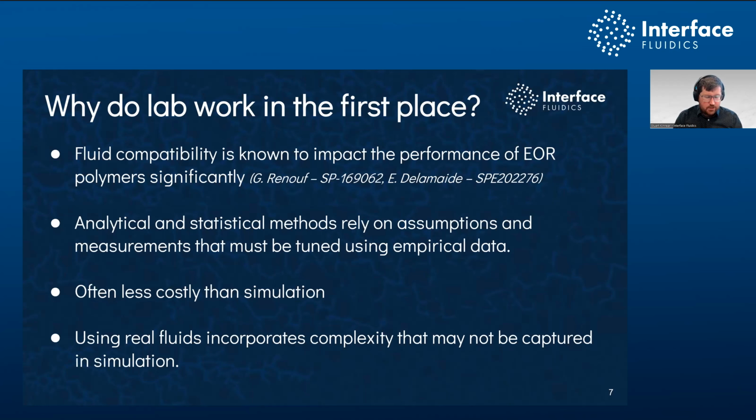And finally, using real fluids incorporates the complexity that is very challenging to actually capture in a simulation program. The nuanced changes in oil composition or water composition over time is really challenging to model accurately, especially without having good data in the first place. And so whether or not you think you're controlling for it, at least if you're using real fluids at real temperatures and pressures, you get real reactions that may or may not have been captured in those simulation software. So empirical data does capture things that simulation cannot capture.